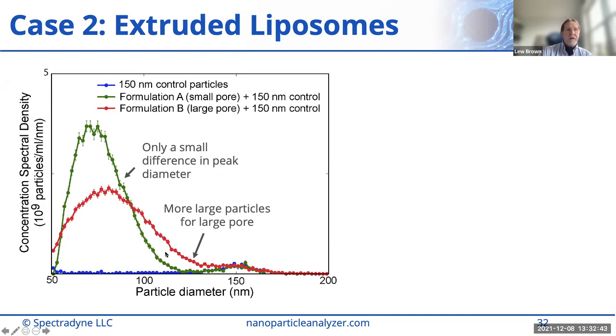And that's represented by the difference here between the red and green lines. So for instance, if I integrated where they cross here, where the red and green lines cross here out to say around here, I would get a higher concentration for the red because it shows that here in the graph. Okay, and it's very easy to interrogate the data that way.